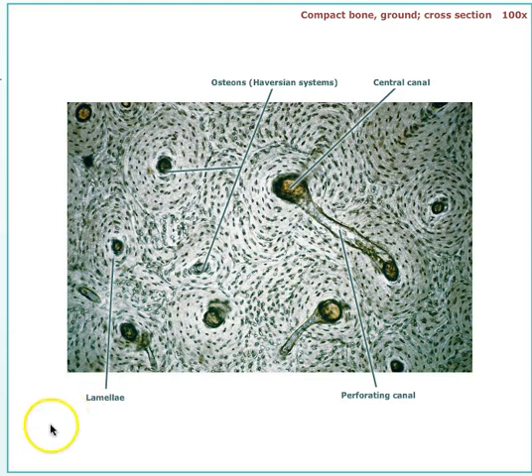This is bone. So bone tissue, quote unquote, also called osseous tissue. This concentric ring pattern is a telltale sign that you're looking at bone, especially compact bone. If you were looking at spongy bone, it would be a much different pattern. It looks like a sponge under the microscope as well. It's very porous. So let's talk about what we're looking at.